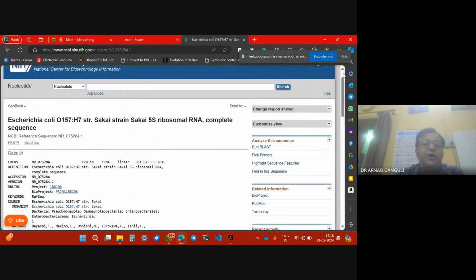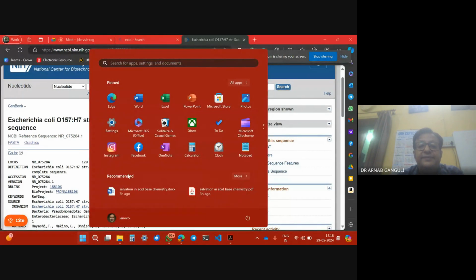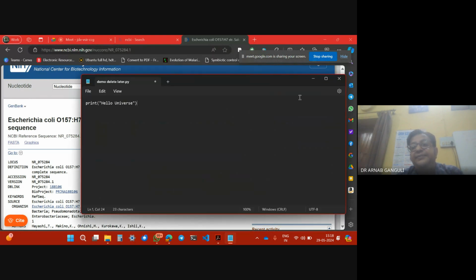So how do you give your boss? You take a printout and give it to your boss. Your boss will say, what will I do with so much? I need just the sequence. Why are you giving me all this additional junk? So what you need to do is you need to open a notepad. This is my favorite thing.